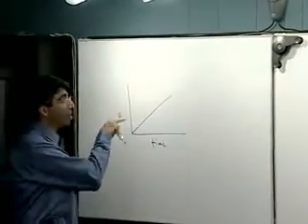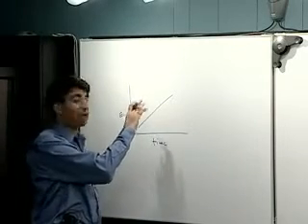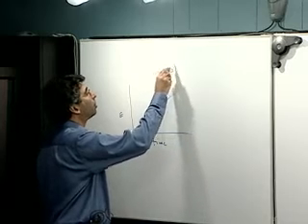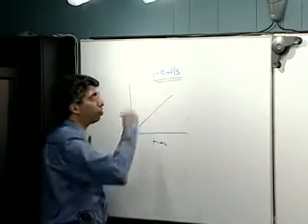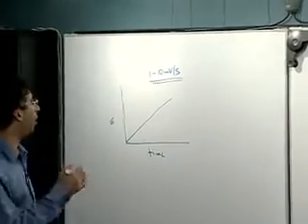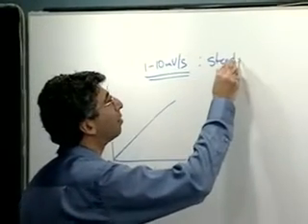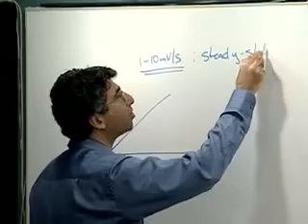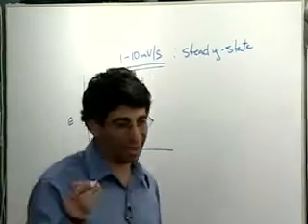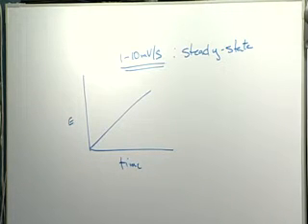And what makes this different from the things we've been talking about recently is this is a slow time change. So we're talking about scanning somewhere between 1 and 10 millivolts per second, very slow compared to what we would normally do for something like cyclic voltammetry. And we're going to attempt to develop a steady state situation and use that to understand thermodynamics primarily, but also kinetics in the case where the kinetic times fit in with what we're looking at.